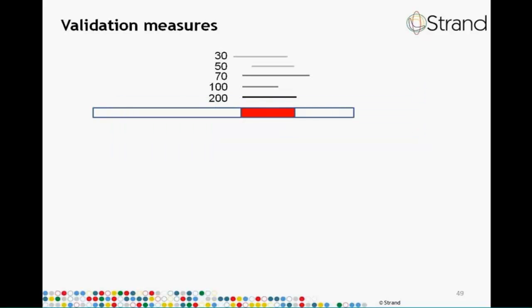Let's go back to this picture that I showed a few slides ago. It shows a precursor miRNA gene and an active region, and we have different reads aligned against that particular stretch of the genome. We would like to find out how many reads out here do not match the 5' end of the active region, how many reads do not match the 3' end of the active region, and how many reads have mismatches in the active region stretch. All of those are indications that the annotations could be wrong or that something different is happening in this particular sample.